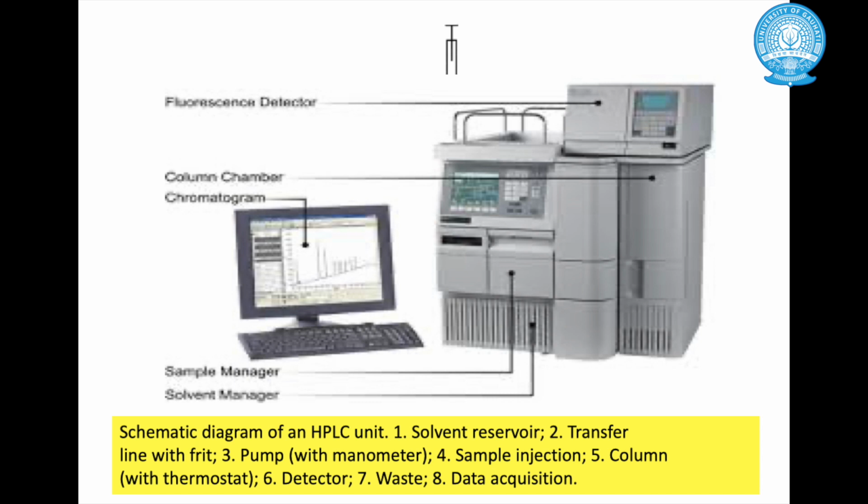One such column which is commonly used these days is reversed phase C18, in which the silica here is derivatized with a carbon 18 chain compound, and this derivatization renders the silica non-polar.